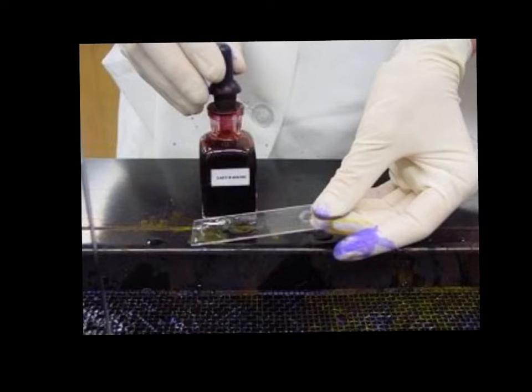At the end of rinsing and blot drying, we will then add our counterstain. We will let our counterstain set for 1 minute. This is the safranin. At the end of the 1 minute, we will again rinse the slide, letting the water hit above, draining down, and blot dry our slide.